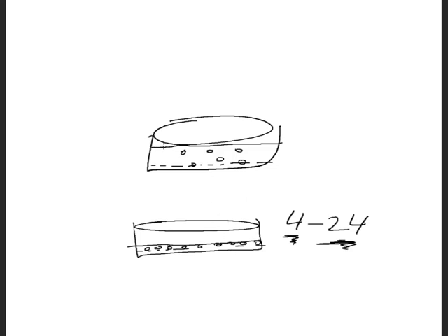So that's why, when you're doing the transformation, number one, you don't use the serum media, you use serum-free media, so that when you combine your DNA with this reagent, we call it turbofectin, when you combine those two together, they'll essentially form that combined micelle that's necessary to be able to go right into the cells. And this is why we have a low amount of solution. We do it for a certain time period.